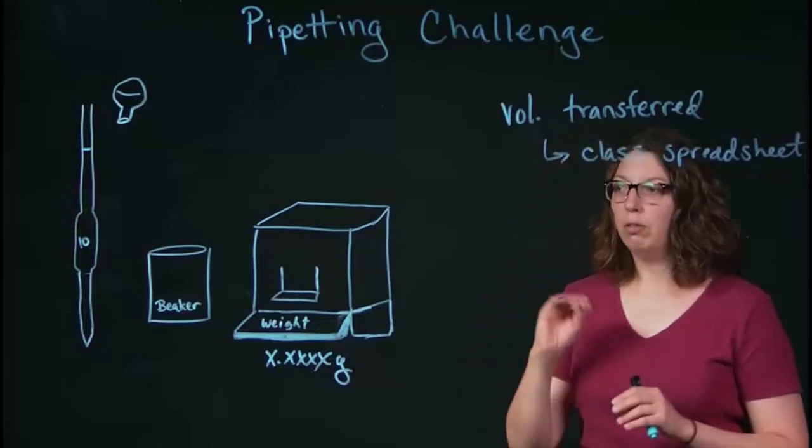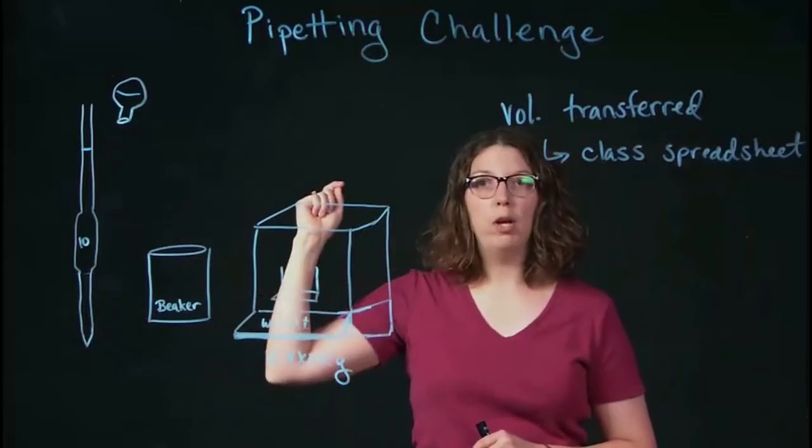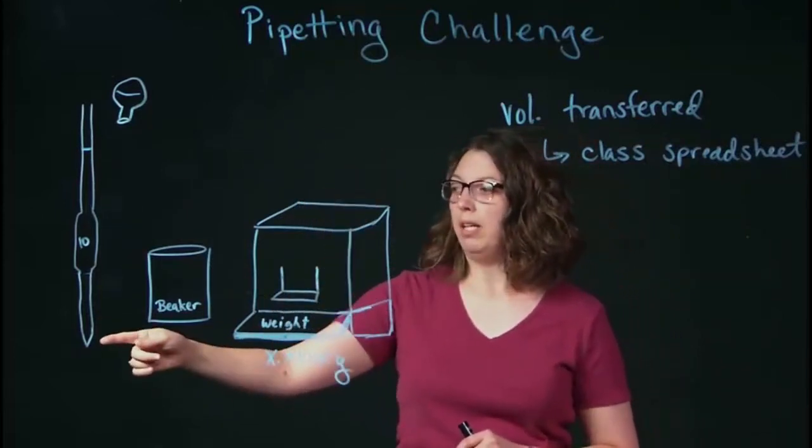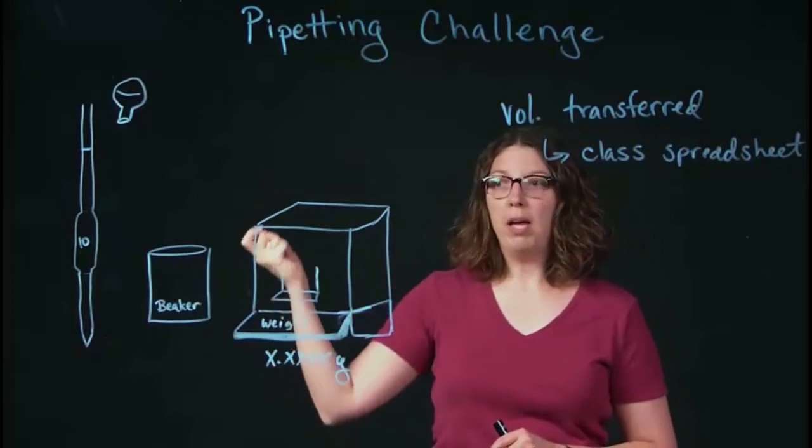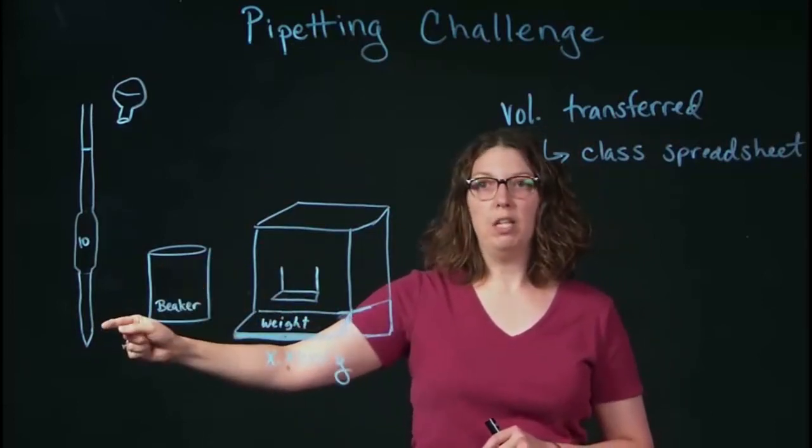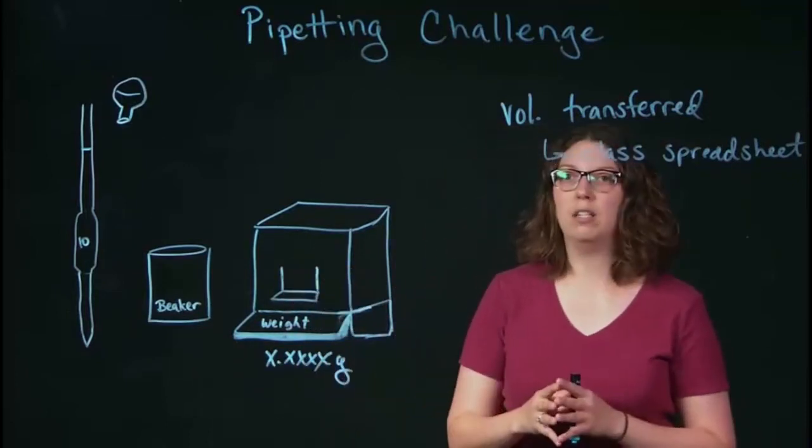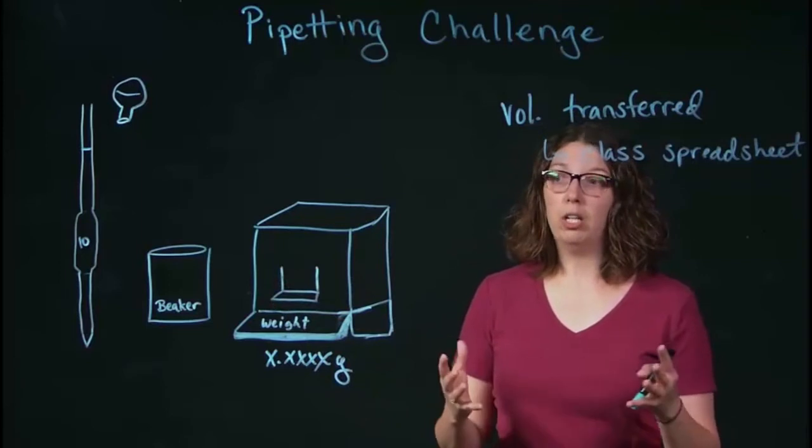And just to sort of list those here, make sure you fill to the line, make sure you have no air bubbles when you fill to the line at the end of the tip. And when you pipette and transfer into the beaker, there should be a little bit of water left at the tip of the pipette that stays there. So those are three things that will help you become really good at pipetting.